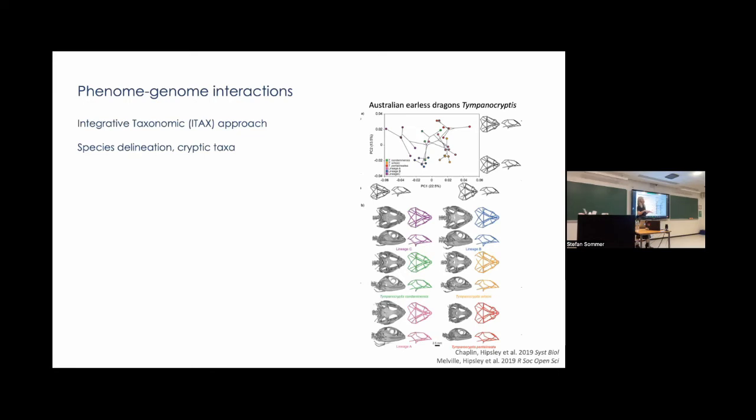And that's, again, the power of geometric morphometrics. I say usually you find evolution where you look for it, but in this case, your eyes will never see these differences. But right when we map this onto a morphospace based on landmarks, and then project the phylogeny into that space, we actually see differences. The skull shape variation is kind of mirroring the differences of the phylogenetic distances in these groups.